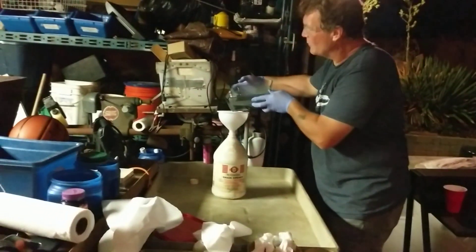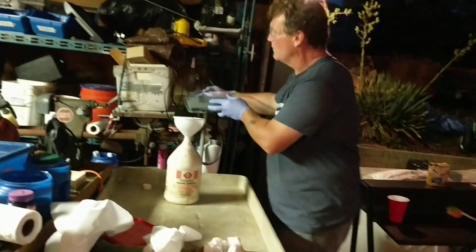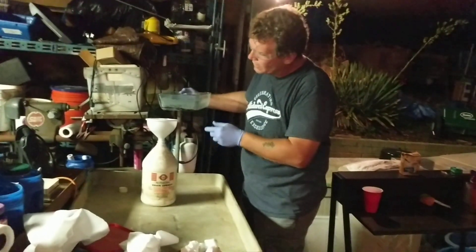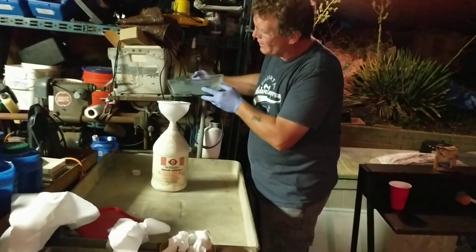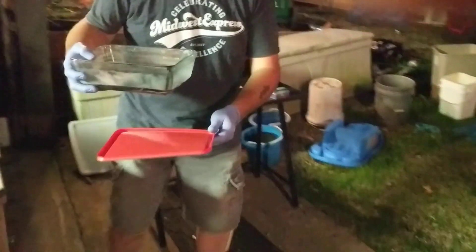We've gotten to the point where I don't want to pour my gold off, so at this point we're going to pour into our rinse water bucket. If I have to clean it again, I'll clean it again.